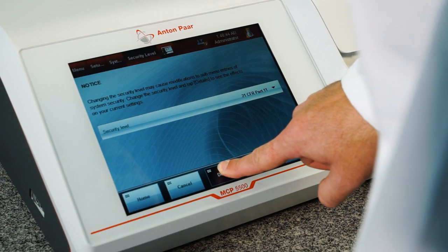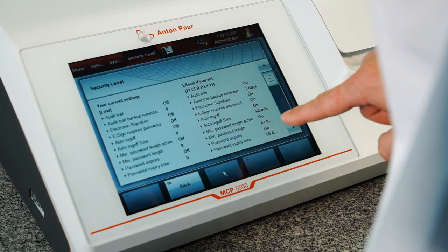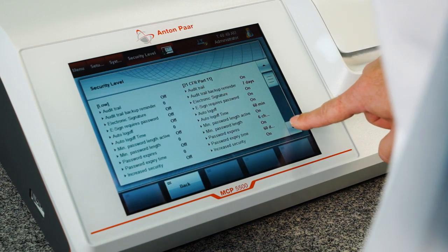To get your polarimeter verified for daily work as quickly as possible, Anton Parr provides a qualification validation package.